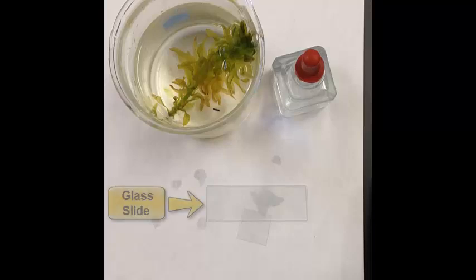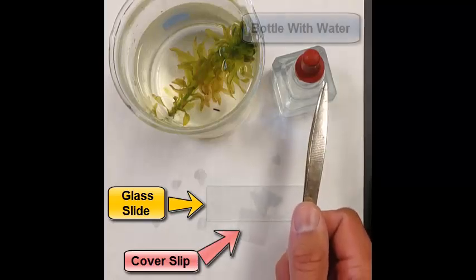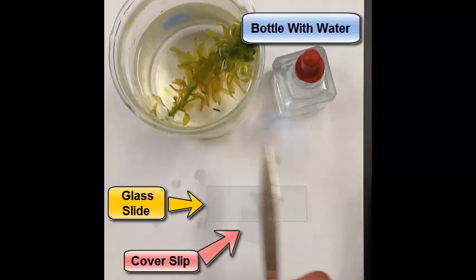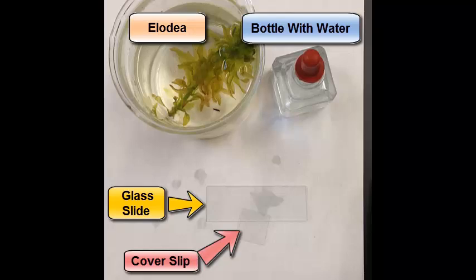So what we have here today is this: we have a glass slide, this rectangular piece. We have our cover slip, which is this plastic square that you should have at your station. You have a dropper bottle with an eyedropper filled with water. And then we have our Lodia, which is the freshwater plant that we're going to be taking a look at.